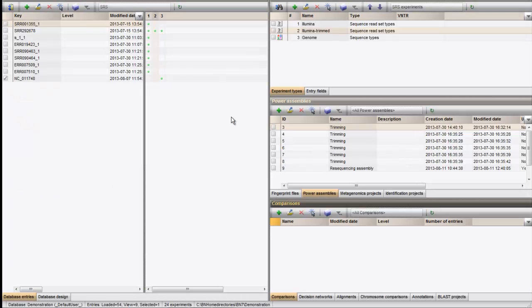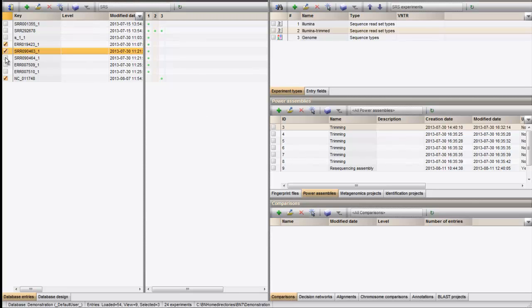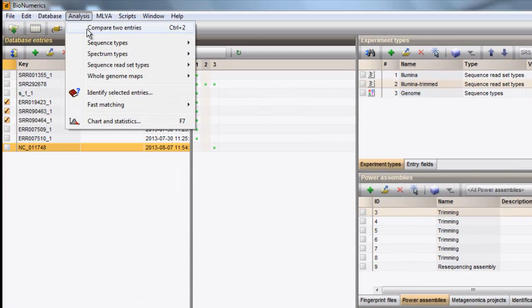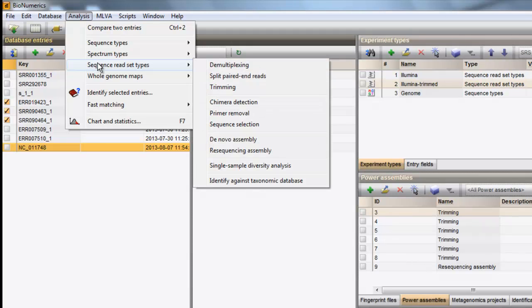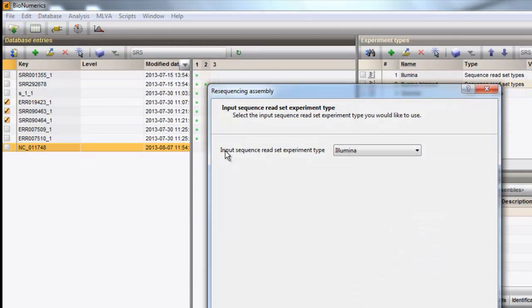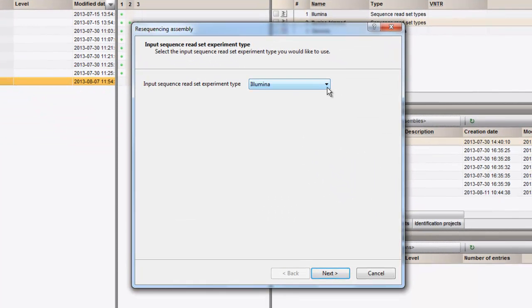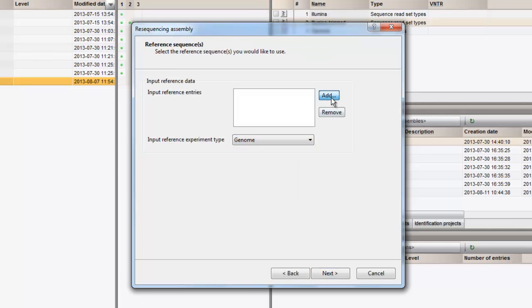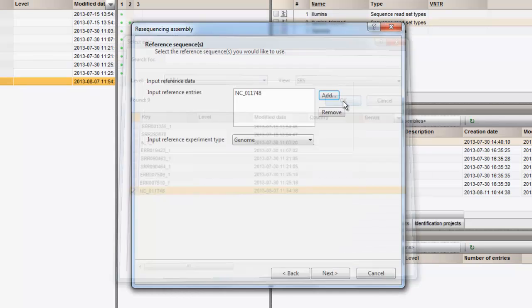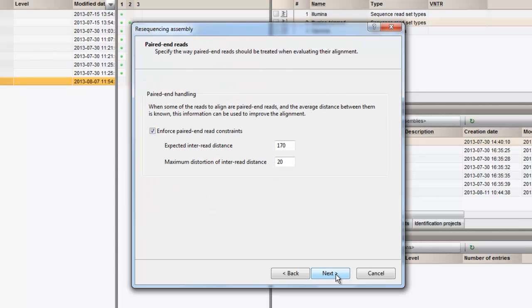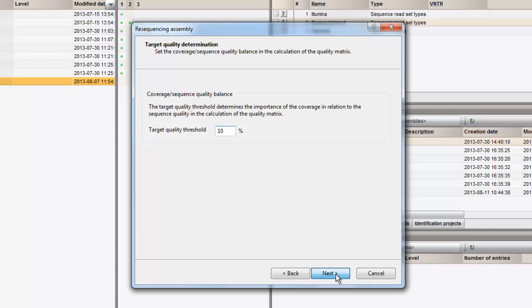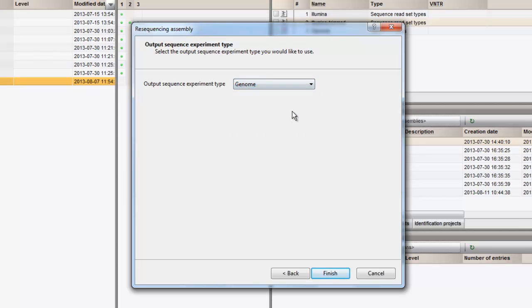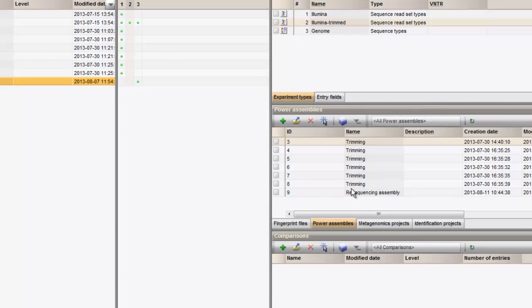Note that if you want to run the same assembly pipeline on a number of samples, you can do this in batch by selecting a number of entries in the database and start the assembly simultaneously on all the selected samples. This will automatically generate an assembly project for each sample and execute these in batch.